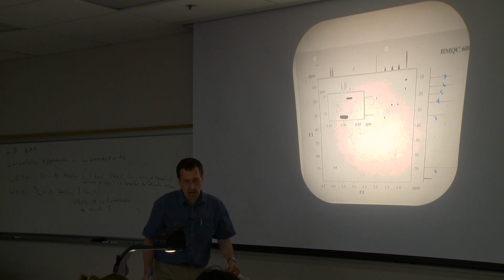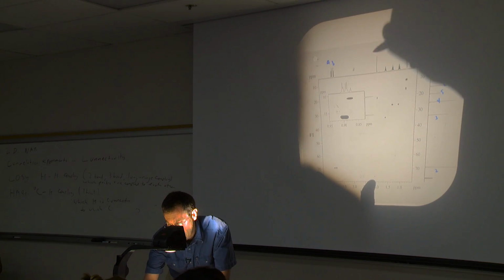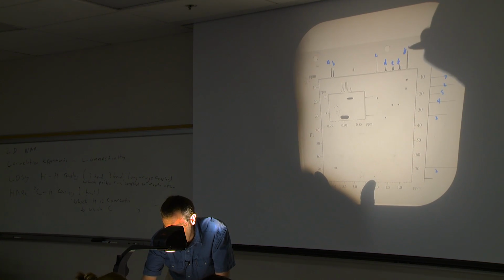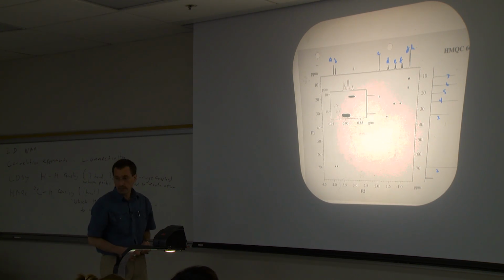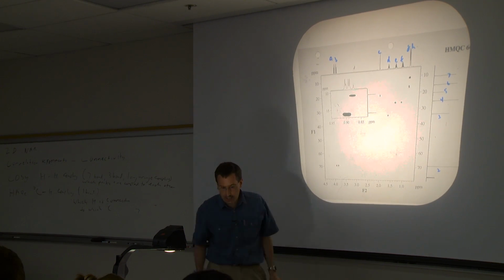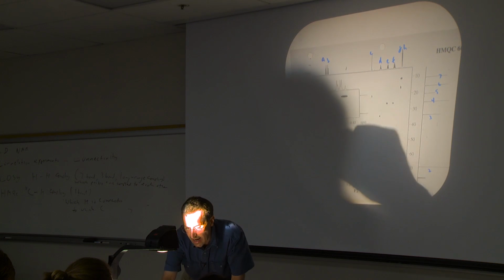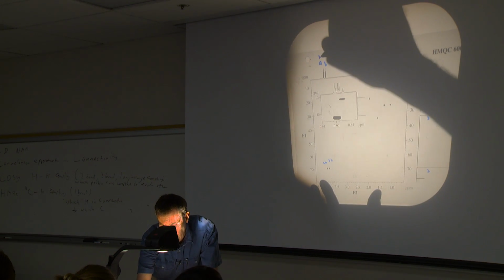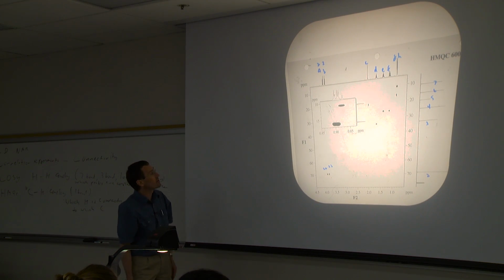Here are our protons: A, B, C, D, E, F, G, H. I get very, very particular about continuing to label things. Now we'll get our connectivities from our cross peaks. So we get 2 connects with A, and 2 connects with B. I usually like to write my numbers over my letters on top.